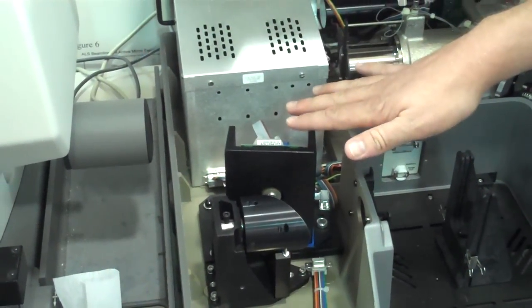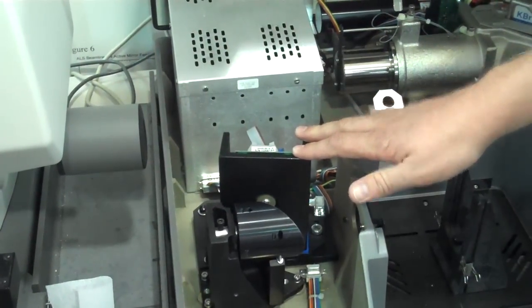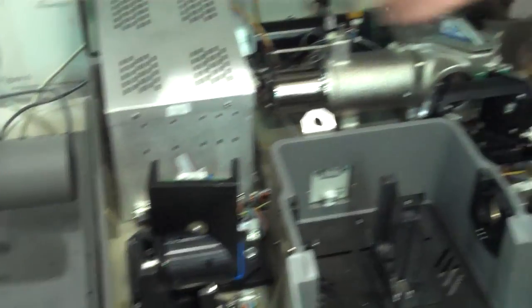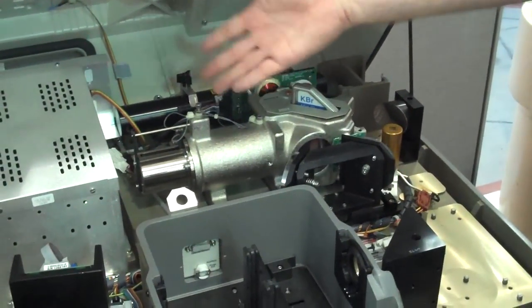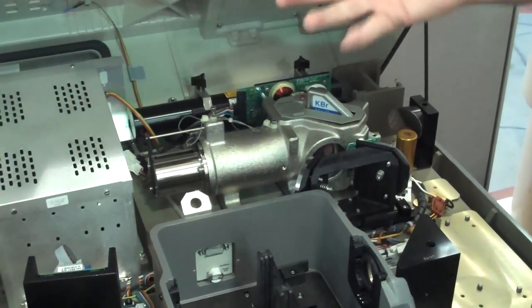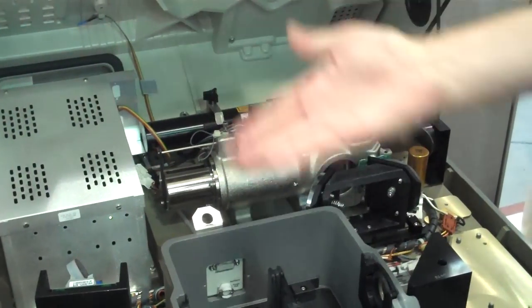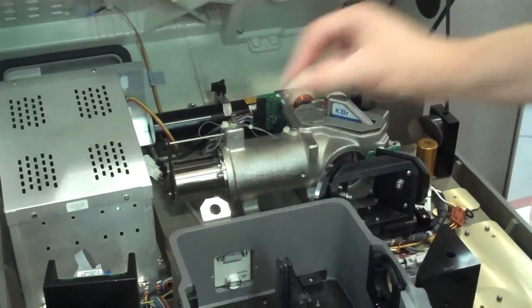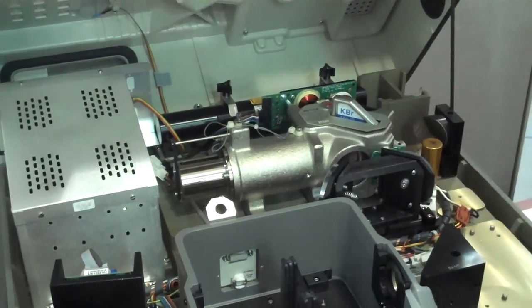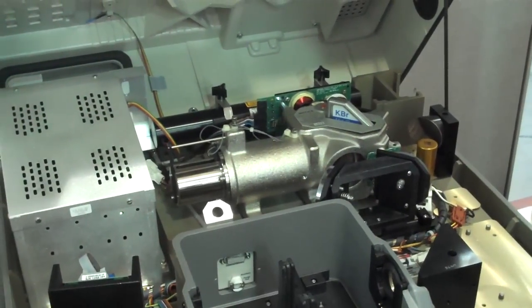So now what we do is we just measure the amount of detected light as a function of the interference that we're putting on it by having one of these mirrors moving back and forth. It's called a Fourier transform spectrometer because you do a Fourier transform of this measurement, of this interference pattern, and that gives you the actual spectrum that you're looking for of the sample.